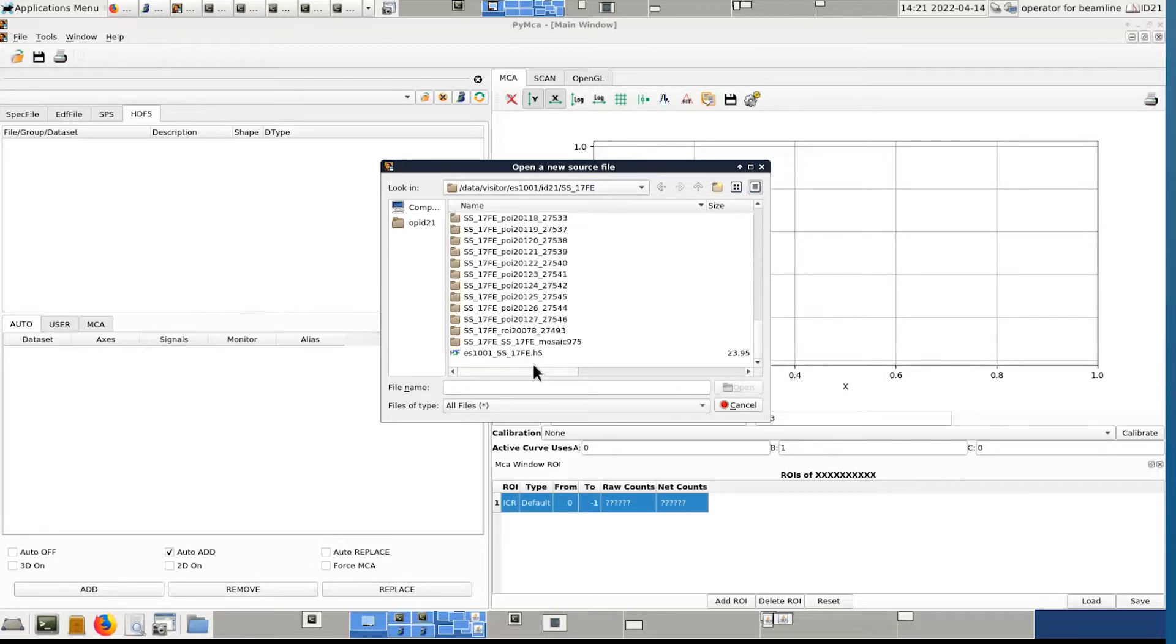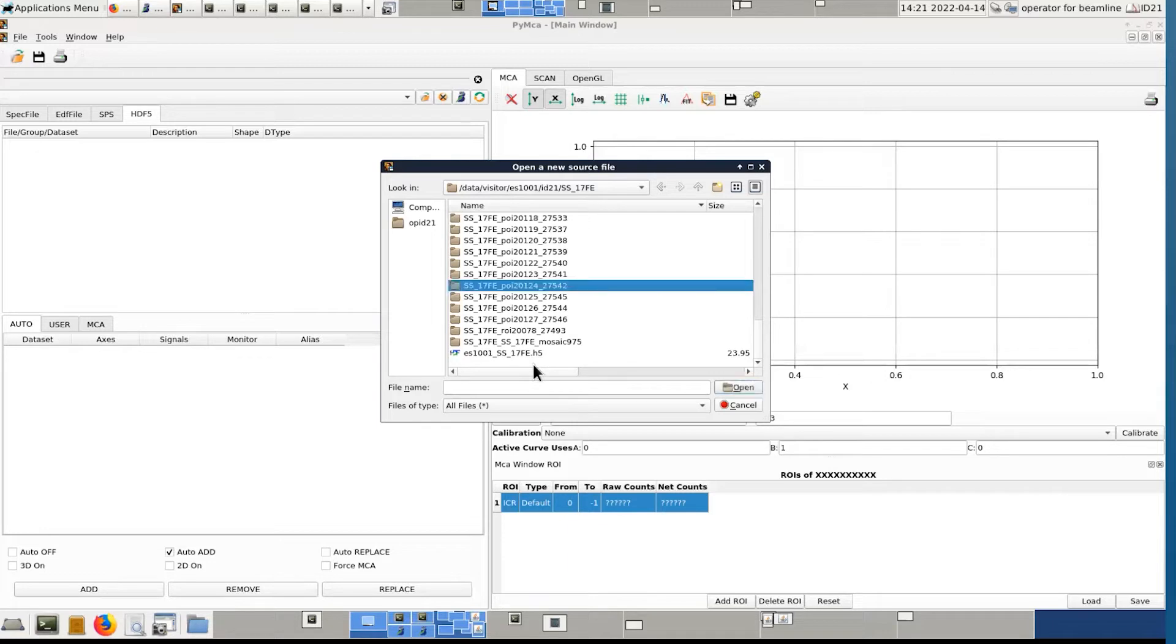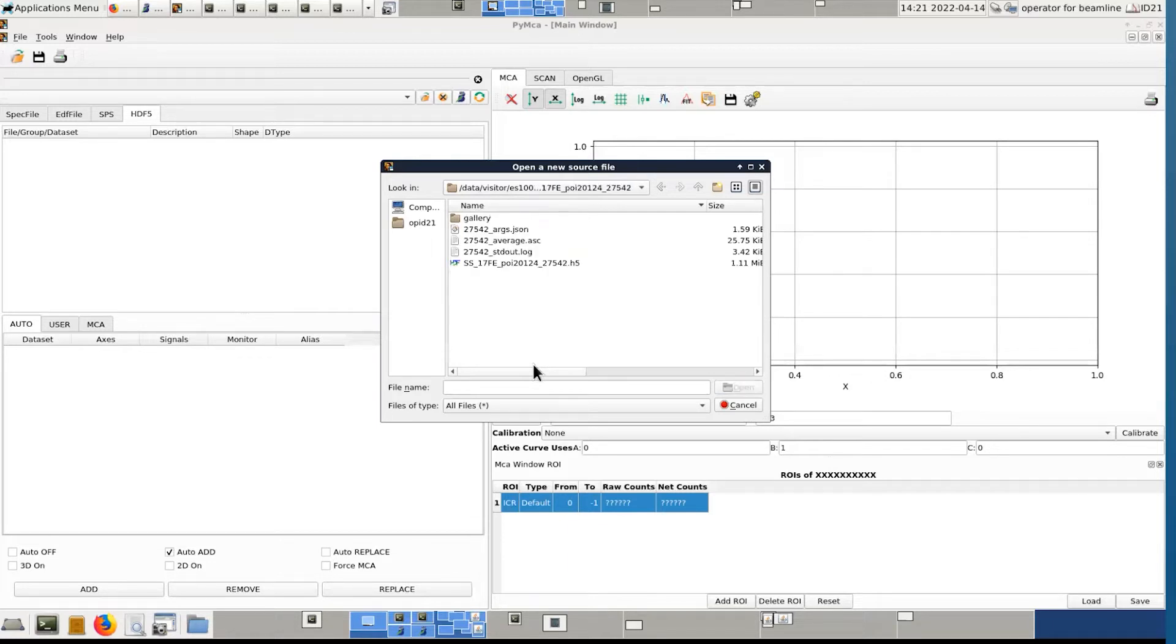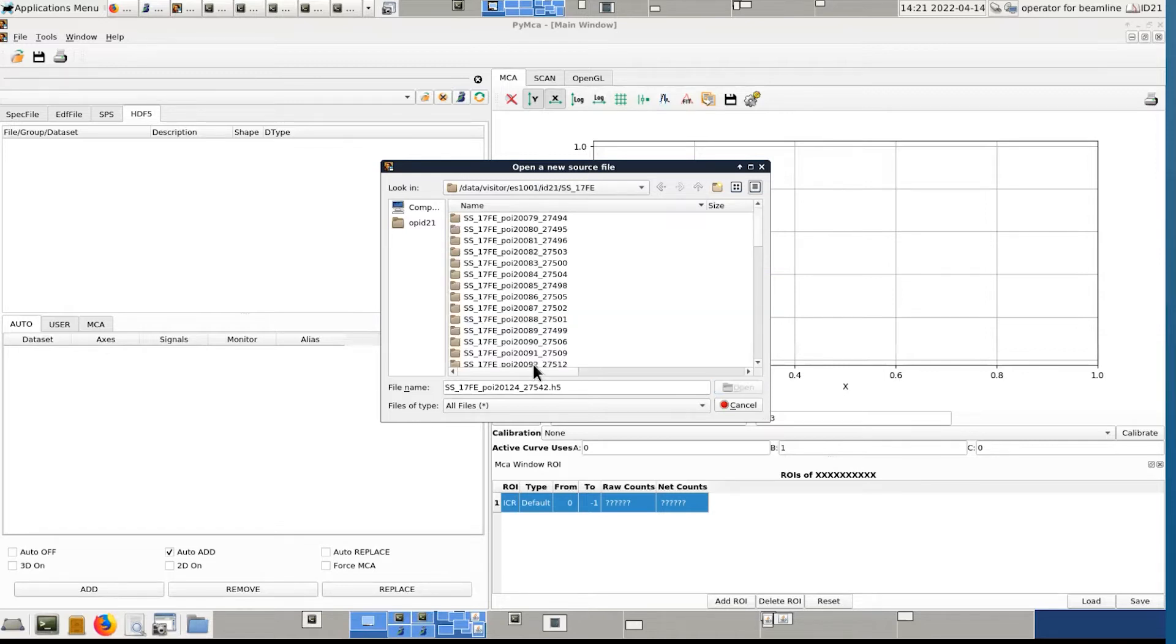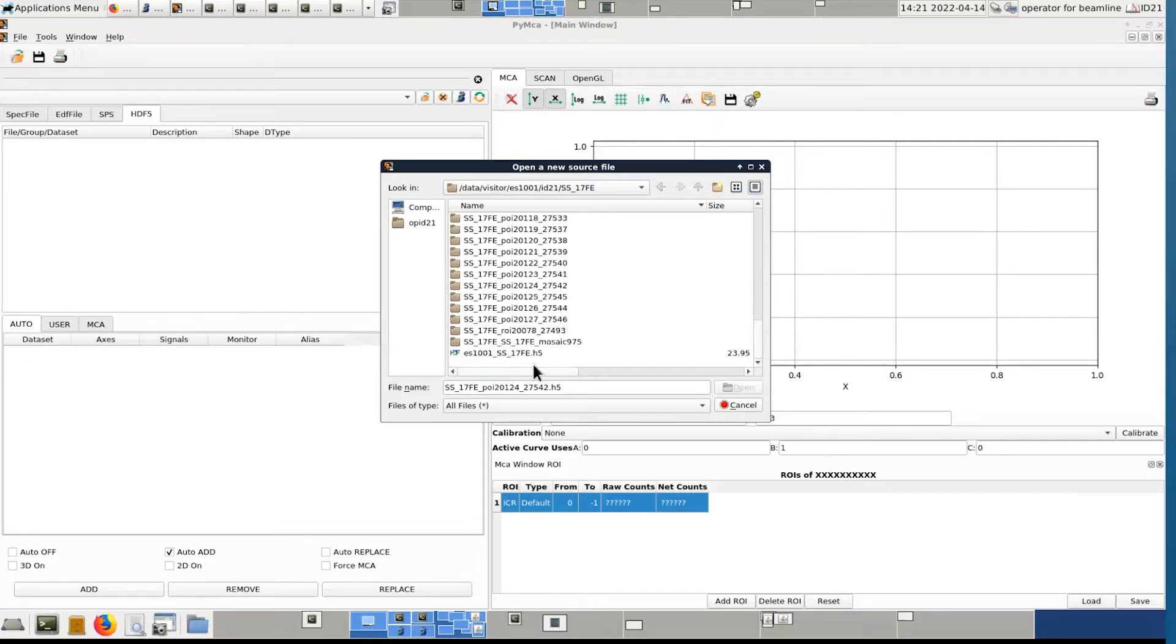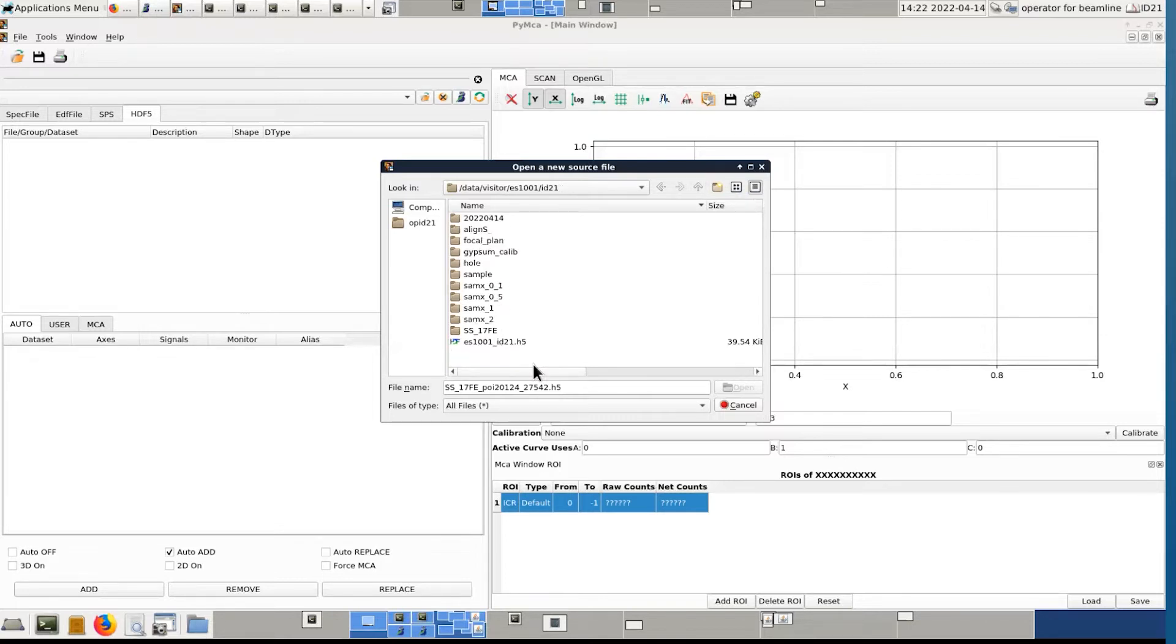What you see is that you have one folder per point of interest or region of interest. We could open one by one, but it would take ages. So instead of opening each individual file, because this is where the data is stored, we have master files, which are just creating links to all the files which exist. These files, they are H5 files.